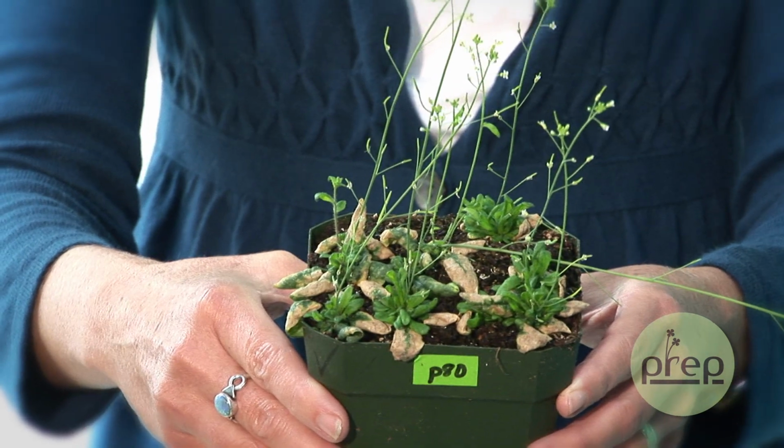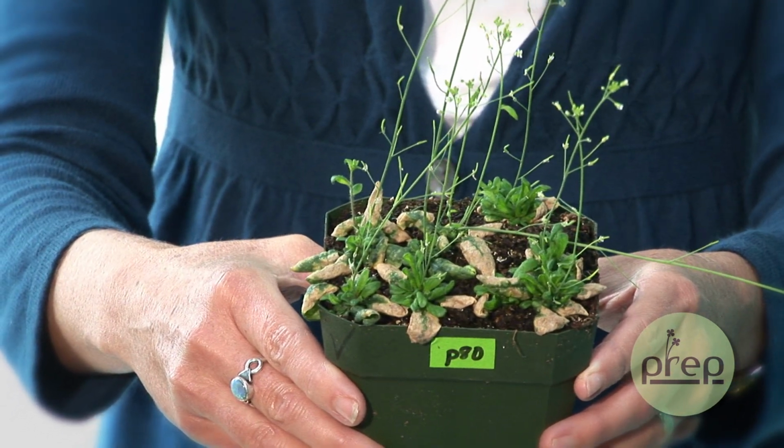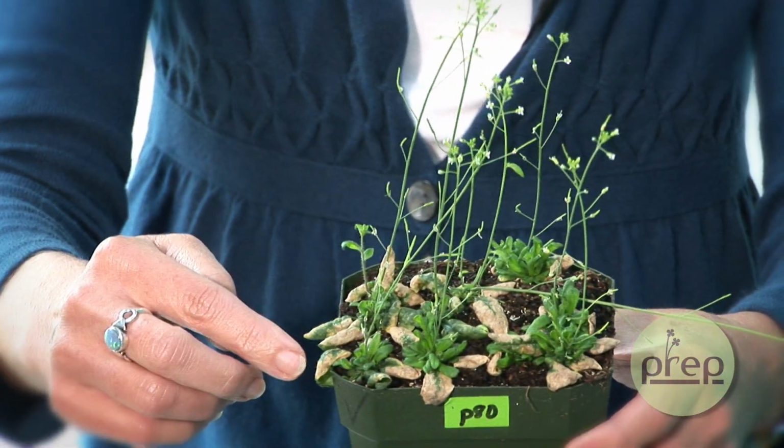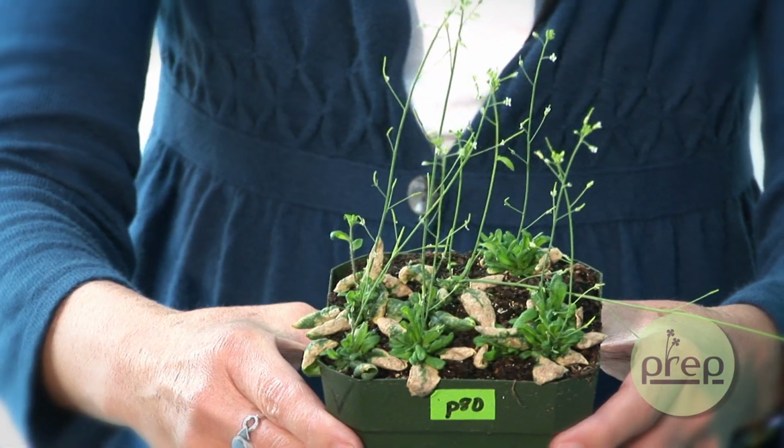So this is another set of P80 mutant plants. And what you'll notice right away is they look very different. And in particular, you'll notice that some of the leaves look like they're dying. That's called senescence, and it's happening very early. These plants also flowered early, and you can see the flowers at the top. And overall, they're very small for Arabidopsis.